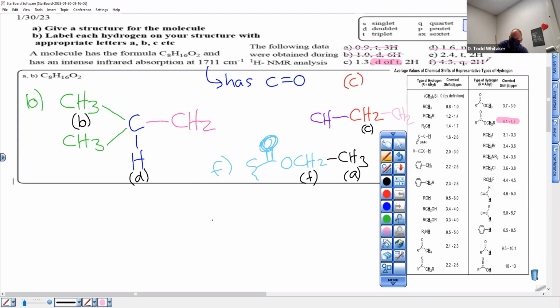I've been doing this a long time. As soon as I see a 2.4 and I know there's a carbonyl, I'm just going Greek. I'm saying alpha. If there's a carbonyl in a molecule, there's a very good chance there's a carbon next to it. And we now know that's a special carbon called alpha. And alpha has nice numbers that are very easily spotted in NMR. They're down here, alpha. Let's give you a reminder, these are alpha. One away from a carbonyl, and that fits our 2.4 very nicely, right? If it's the internal one at the bottom instead of the terminal one.